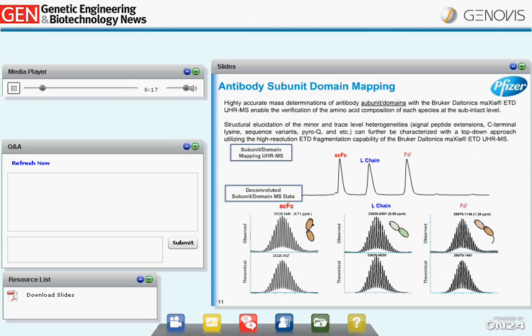Here we show this particular approach, taking the FabRICATOR down on a mAb and then doing a complete reduction, and now we have the separation. This separation shows the power of the technology altogether, where we have the use of the enzyme, the mass spec, and now the separation on the UPLC. We have the separation of the single chain Fc, which is the first peak shown in the chromatogram. We have the second peak shown, the light chain, and the FD.